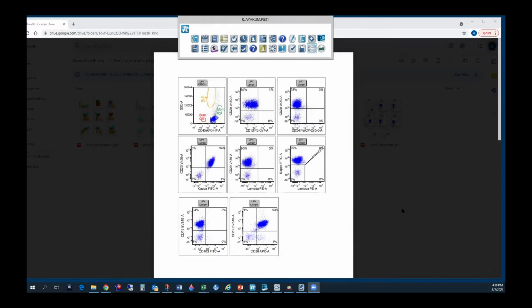So the line separates CD20 negative and CD20 positive. And same goes for plot number 5. Again, the lines were placed in between, where they thought a positive population of CD20 is residing, and the negative is residing just below it. So they do that for each single plot every single time. So it's not standardized or anything?